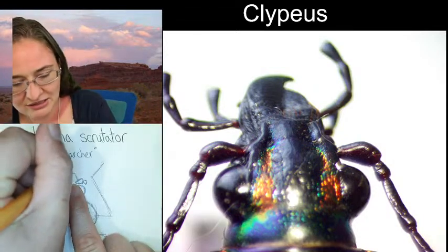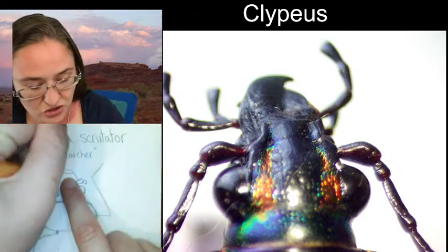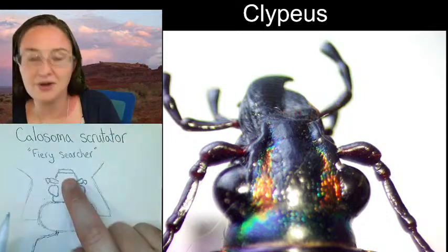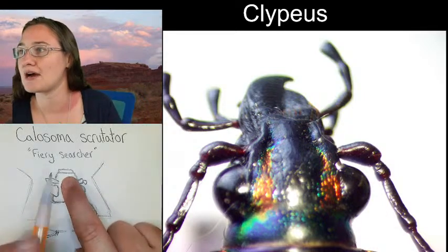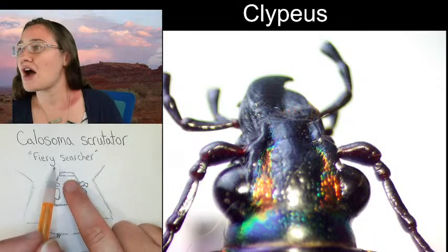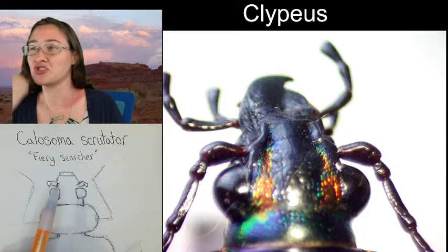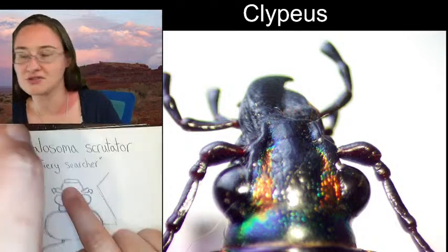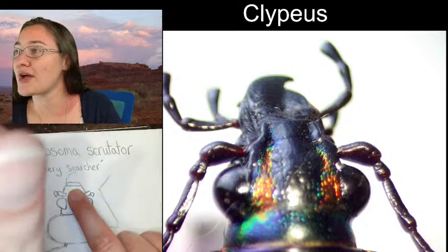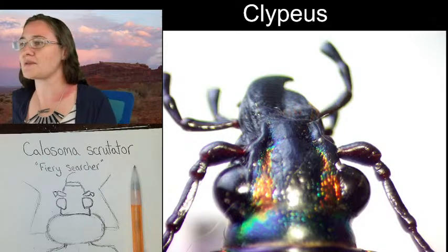And this next little square, this segment here, is going to be our clypeus. After our clypeus, we are going to have the labrum, but in this one, it's not super visible, so we're going to go directly to the mandibles, which are these guys right here. The left one is going over top of the right one, and I believe that there are some dentations.